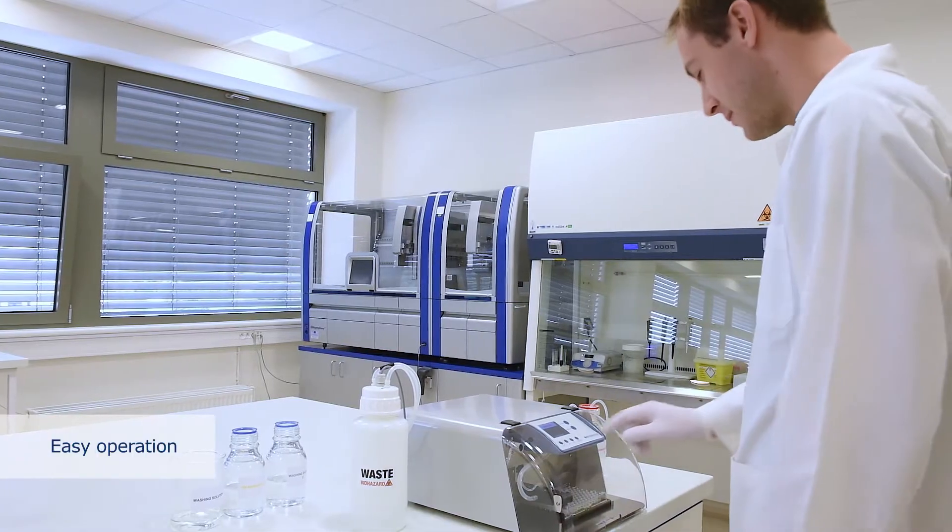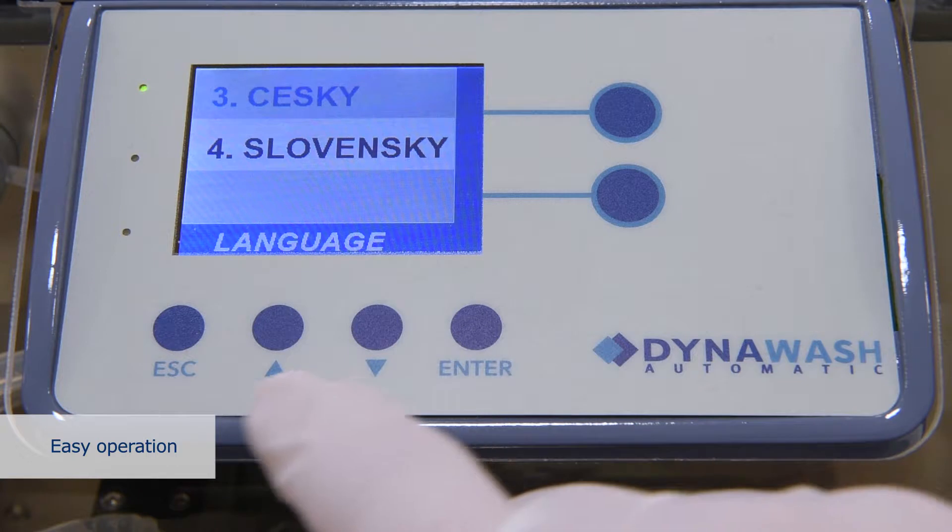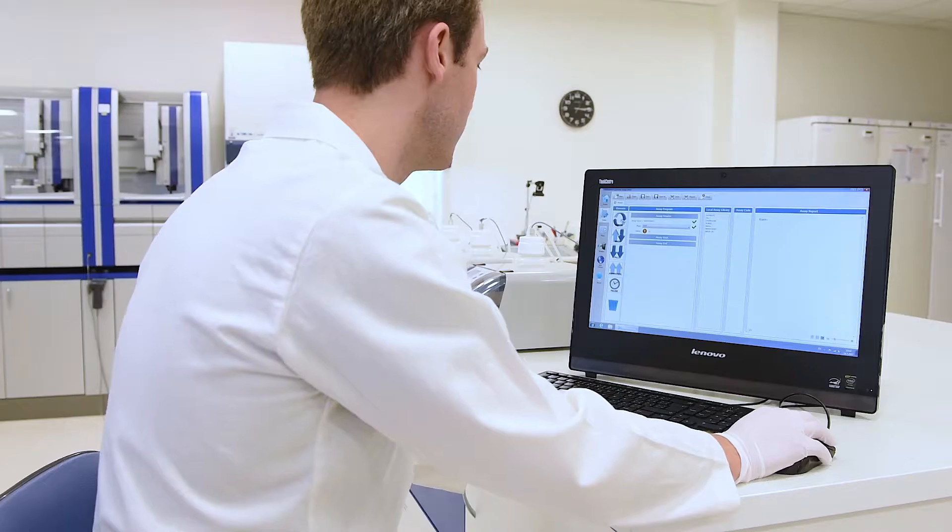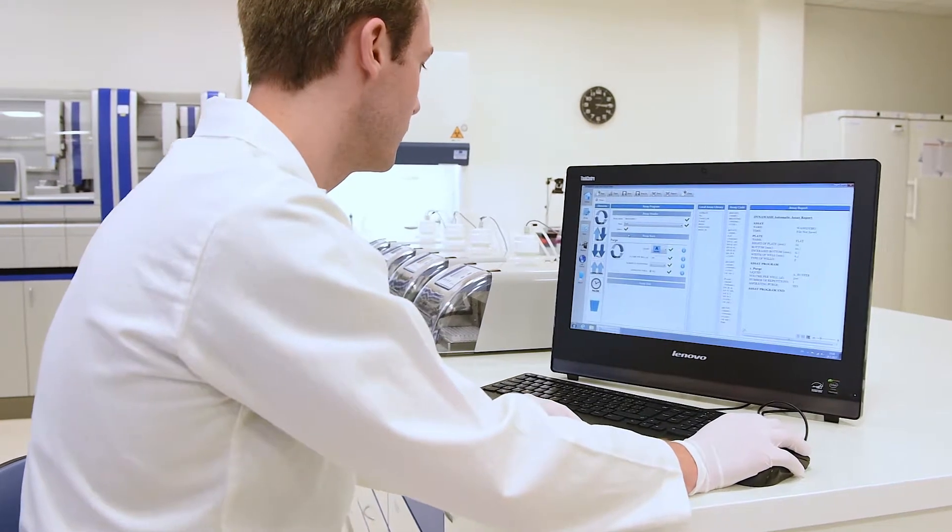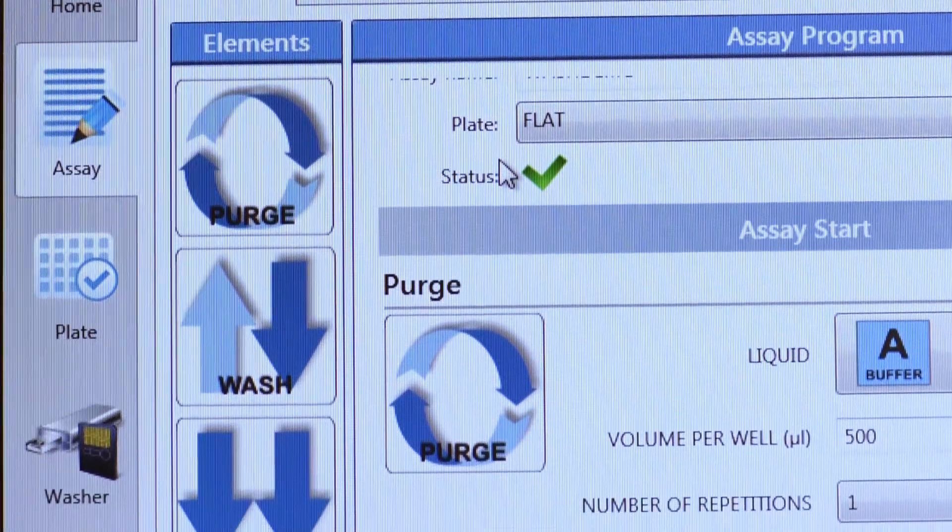The operation of DynaWash Automatic is easy using touch keyboard and color graphic LCD display. The user can select language version. Assay programming for DynaWash Automatic takes place on any PC. The PC software comes with the washer.